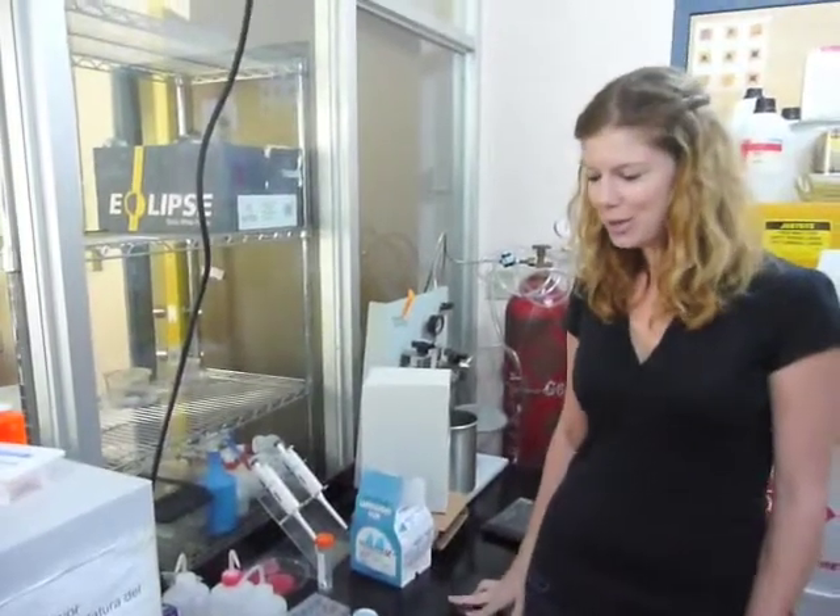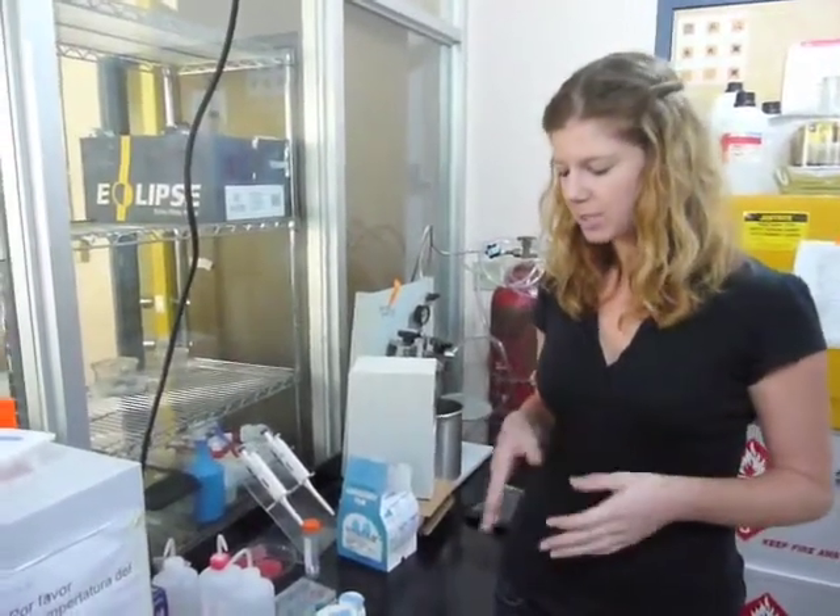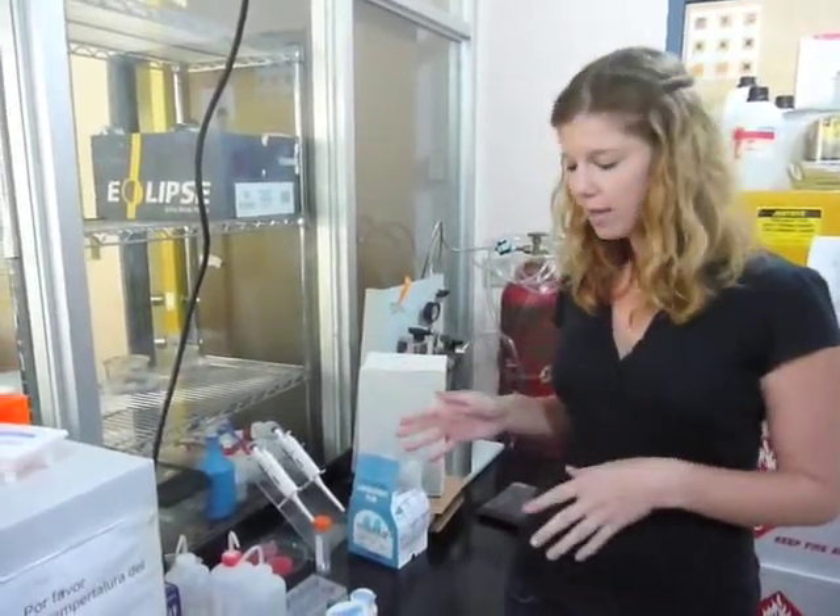Today I'm going to show you how to prepare larvae for SEM. The larval preparation can be split up into three different main steps: there's relaxation, fixation, and drying of the specimens.